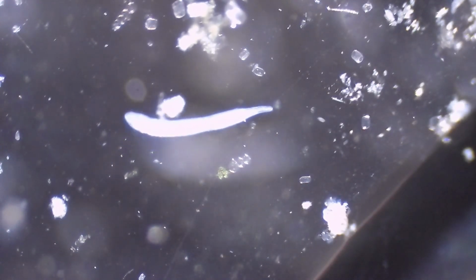Tons and tons of life in this single droplet of water. Guys, that's just in one drop of water, about as big as my fingernail here on my pinky. We saw tons of little tiny things, I don't even know what they were, and then we saw larger copepods, I think. We also saw little bitty worms. They could be paramecium, it could be some kind of infusoria. I'm not 100% sure, guys.